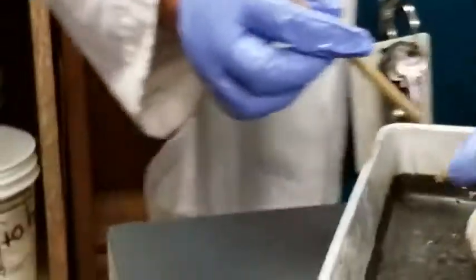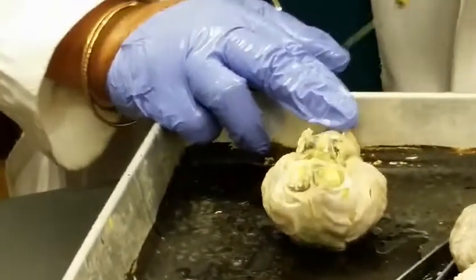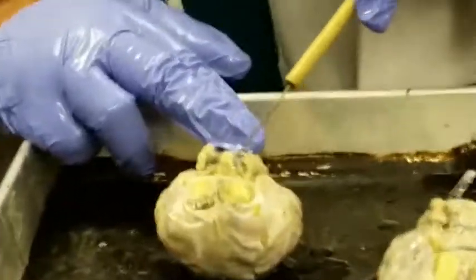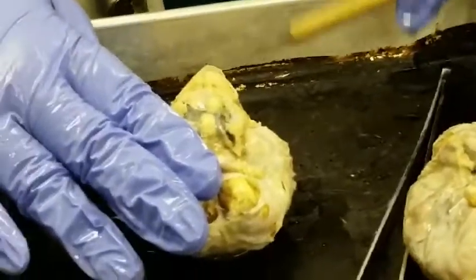Here is another that has not been dissected yet. Again, what are these? Olfactory bulbs. And here is the optic nerve, and in the middle the optic chiasma. This is the pons, followed by the medulla oblongata.